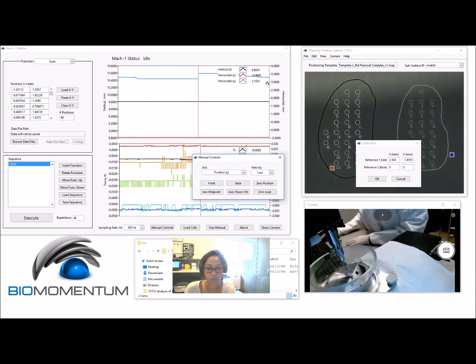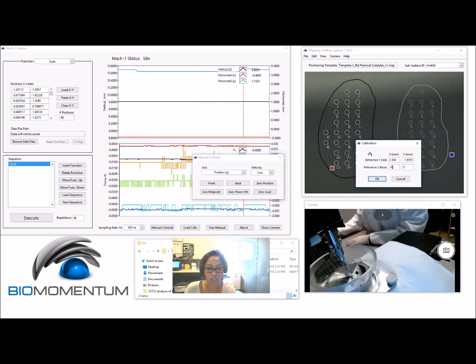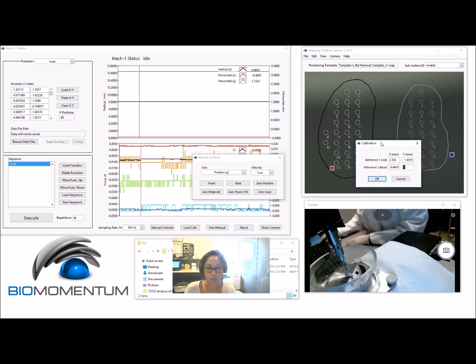Report the X and Y stage position of the second mark in the calibration pop-up window of the mapping toolbox software.